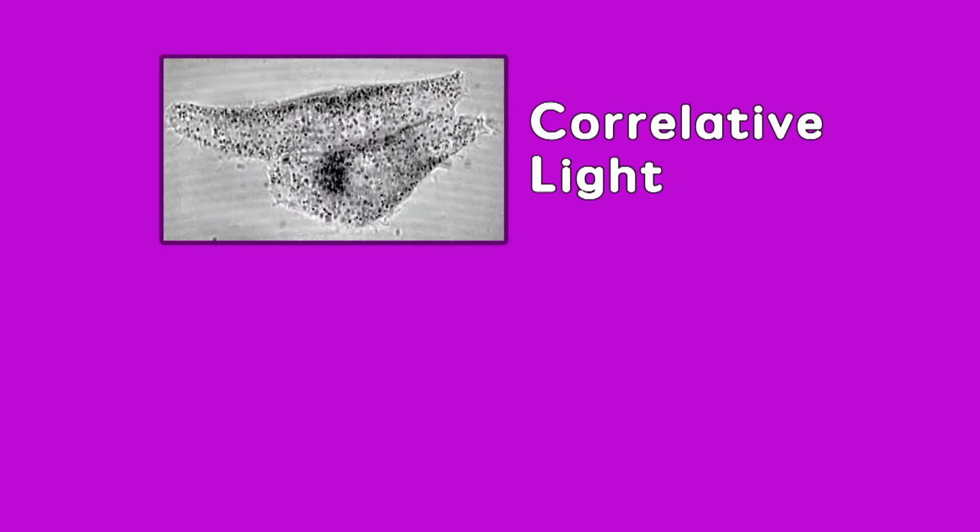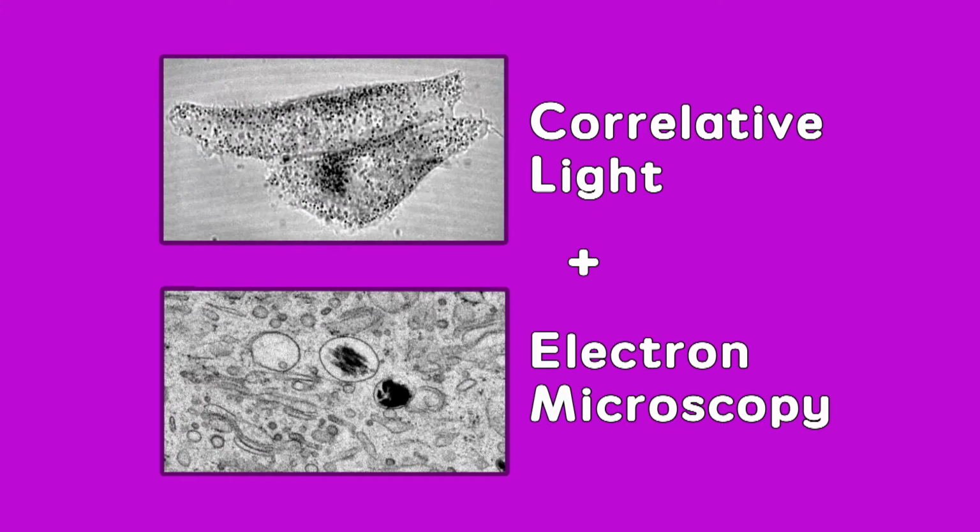Correlative microscopy is actually a scientific approach to combine images from different modalities. Whether they are coming from light microscopy or electron microscopy, then it turns into correlative light and electron microscopy, CLEM. And the idea is to be able to follow something by live cell imaging, and at a given time fix the sample to prepare it by electron microscopy, and then combine these two images into one single image. The combination of these two images can be done by informatics and allow us to track the dynamic information into the ultrastructure of the electron microscope.